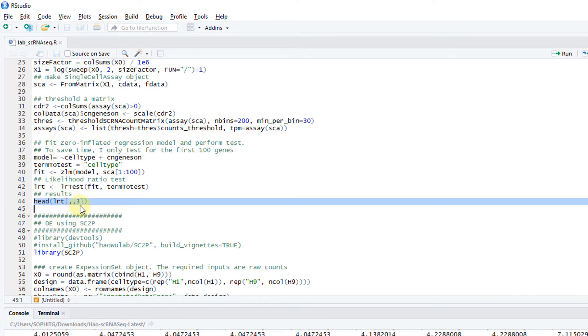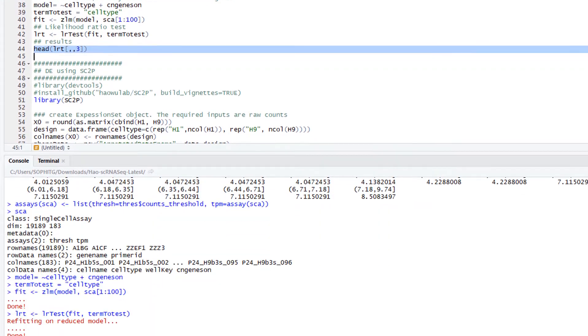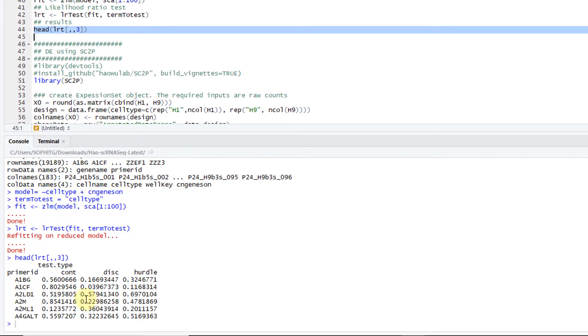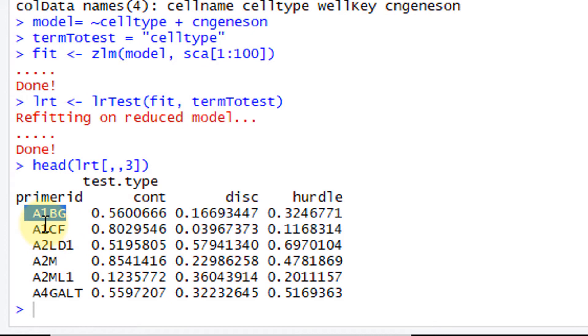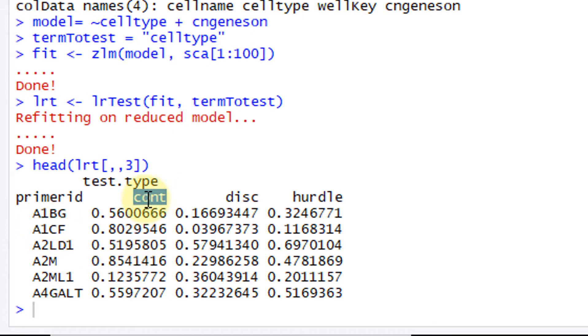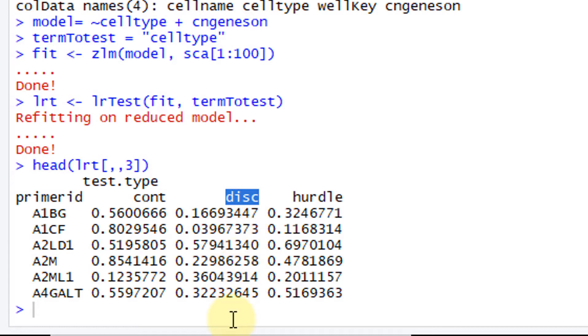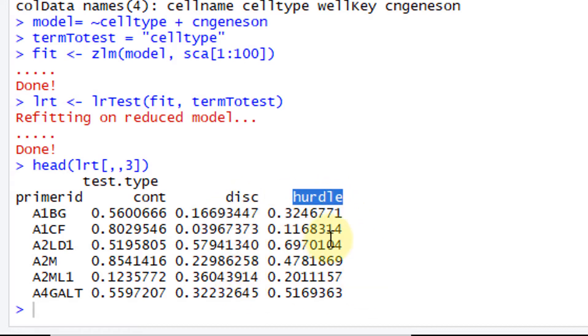This LRT is a three-dimensional array. The third dimension are the p-values. If you take a look, you have three columns here. For each gene, each row is a gene, there's a gene name. You have the p-values for the continuous p-value, which compares whether there's quantitative changes when the genes are on. The discrete p-values test whether the proportion of genes turning on or off are the same in two conditions. And there's a hurdle p-value, which is basically a combination of these two.